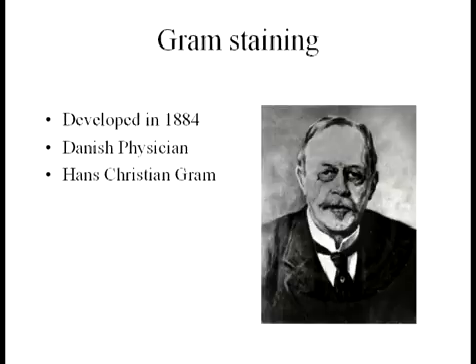Gram staining was developed in 1884 by Danish physician Hans Christian Gram. Dr. Gram had been experimenting with new stains for staining biopsy and autopsy materials when he noticed that some of the bacteria were stained differently than the surrounding tissues. And from these humble beginnings, the widely useful technique of gram staining was developed.